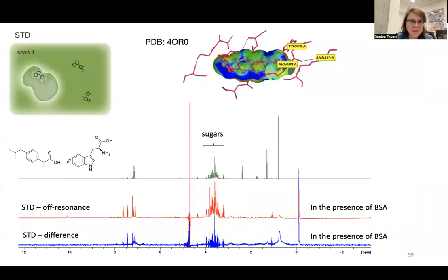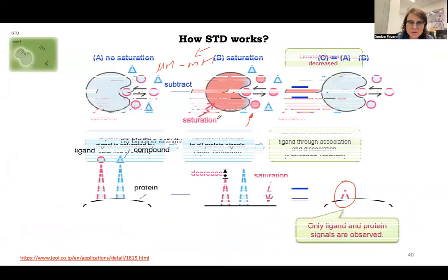This is an example where I have tryptophan and ibuprofen. It's not quite a good example because ibuprofen binds really high affinity to BSA. But I still can see, for example, on the difference, I can see all the peaks from the tryptophan that binds in the micromolar to millimolar range. And also you see all these out of phase peaks here from the sugars that don't bind the protein. These sugars come from the pills. The ibuprofen was actually extracted from ibuprofen pills.